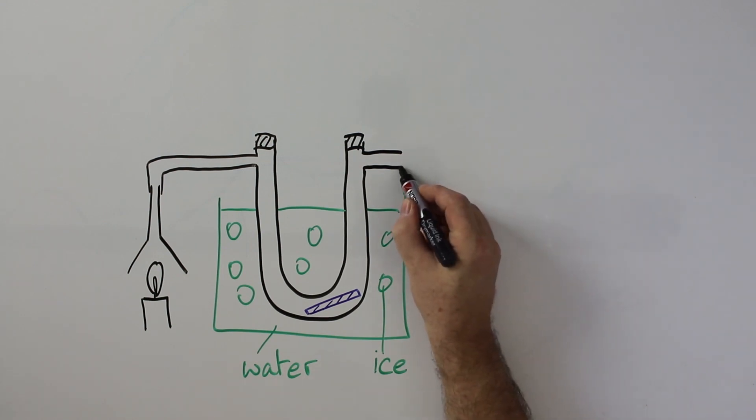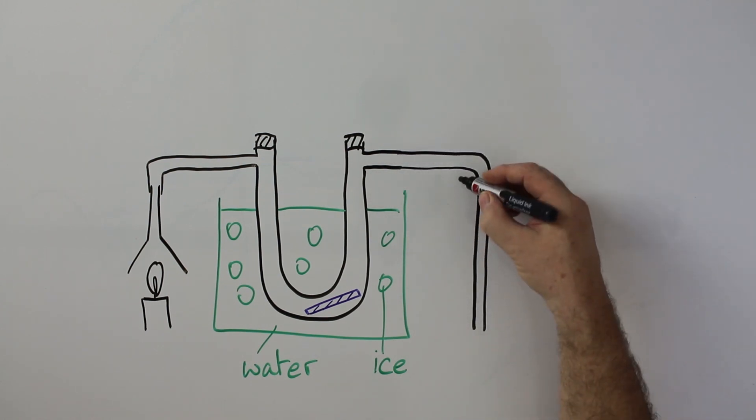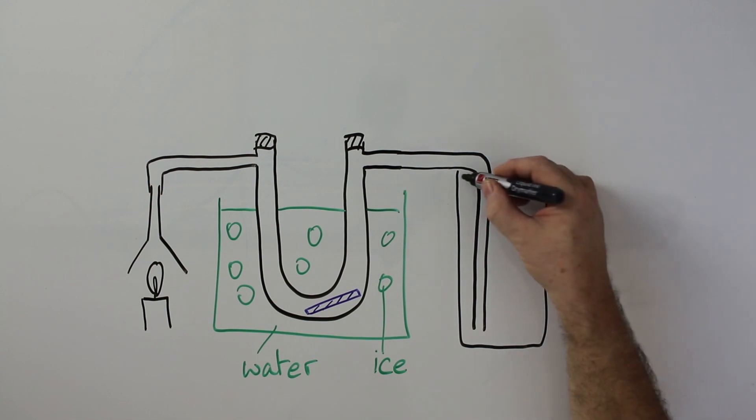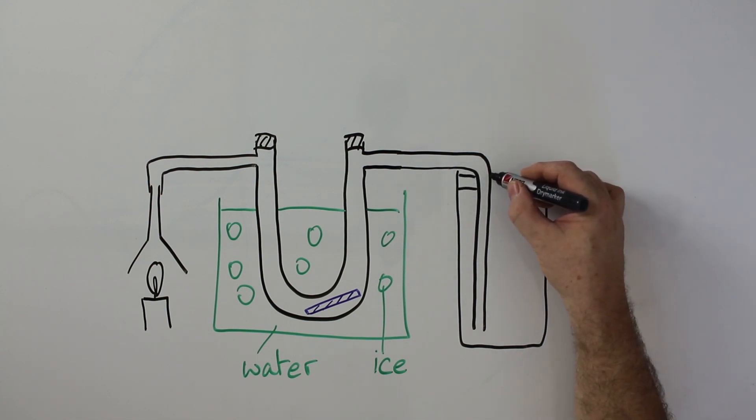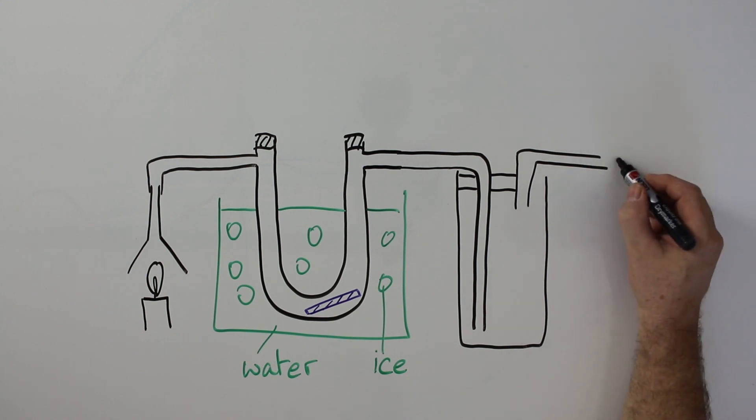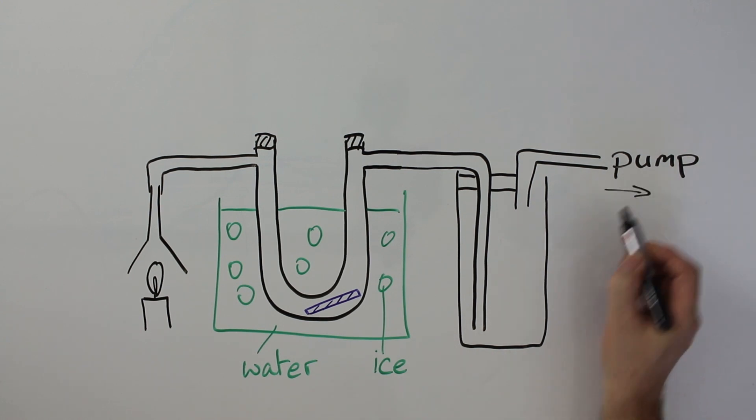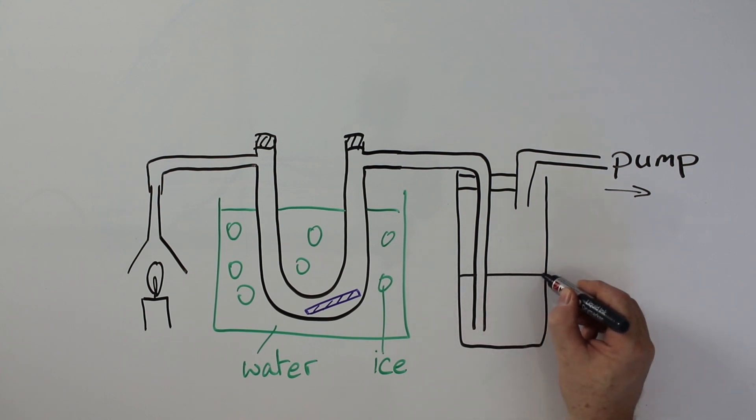From here we're going to take this into another bottle and that's going out to a pump which is going to suck the air through. And in here we've got some lime water. The lime water is a test for carbon dioxide. So let's look what happens.